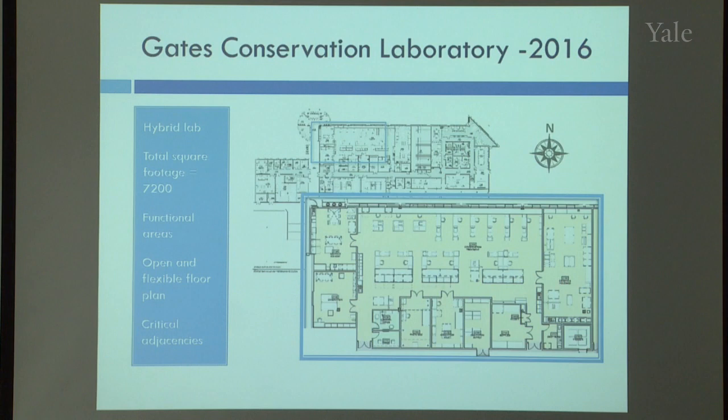I mentioned the ramp. We had an opportunity to create functional areas like our wet treatment and photo dock rooms, things that were separate from the primary main treatment space, so that people weren't collapsing or moving their personal tables and workspaces, so that we could accommodate what are pretty standard separate functions that are now reserved for people and they can use them.